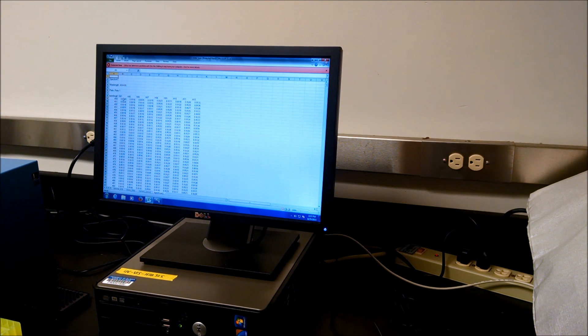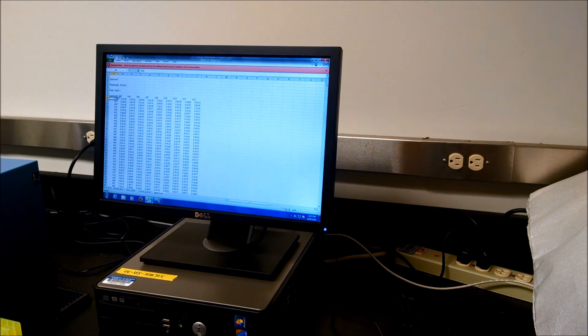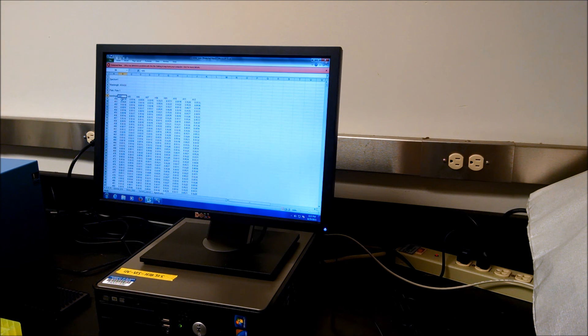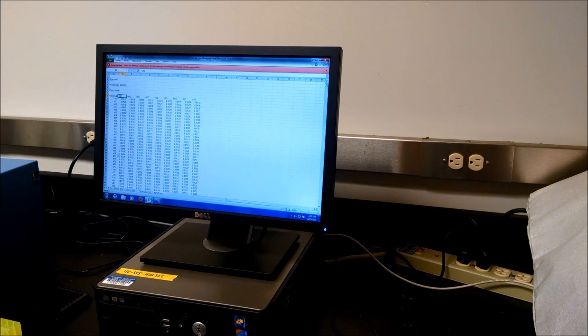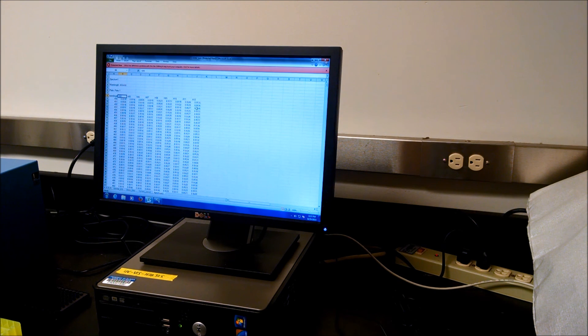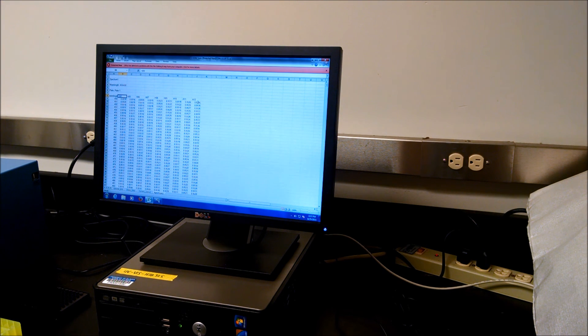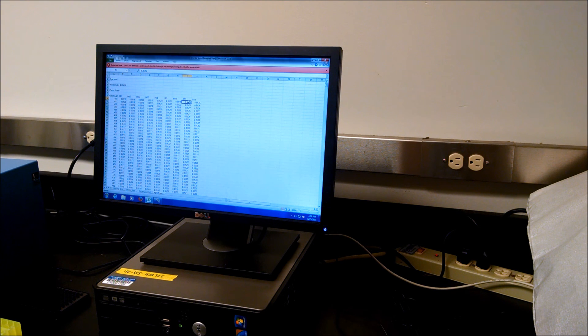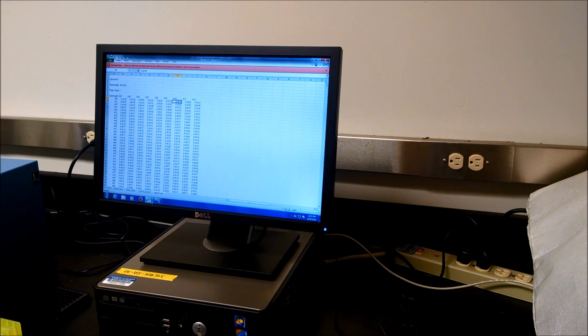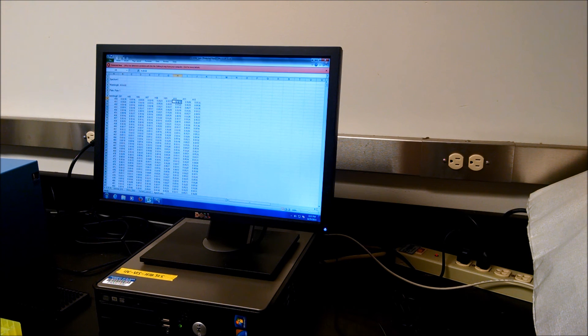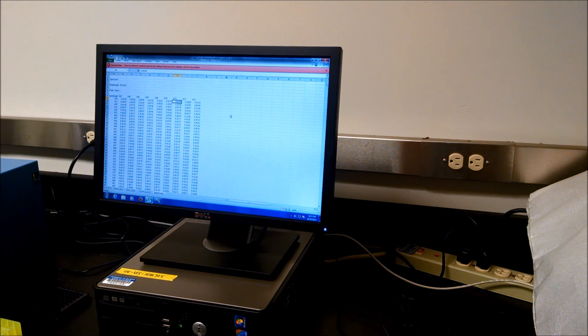And so you can make a graph then. Over here are our blanks. So you want to subtract out the blanks from the absorption spectrum, and then make a graph for your report.